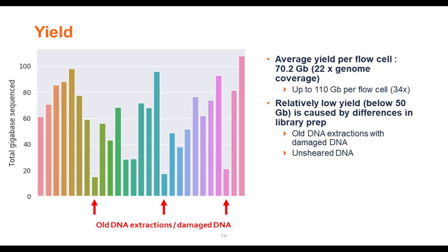A few exceptions achieved relatively low yield: three runs used older DNA extracted eight to ten years ago, which was likely slightly damaged or contained buffer components interfering with the sequencing process. Several other runs also achieved less than 50 gigabases because we used unsheared DNA. Normally we shear our DNA to approximately 10 to 20 KB fragment lengths; unsheared DNA with very long fragments resulted in lower yield. Overall, we get 70 gigabases of output on one single flow cell.